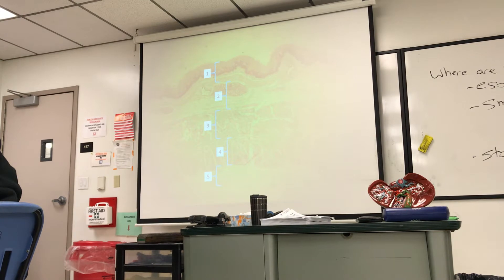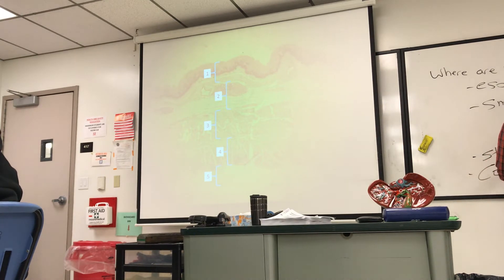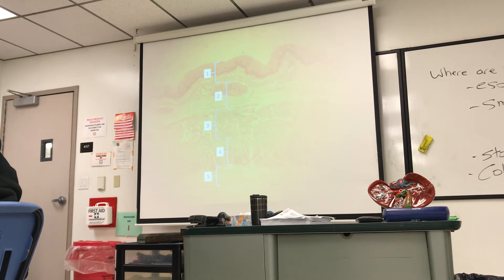And the colon. The colon has different things. The one thing I want to emphasize on colon for the histology are the goblet cells in the epithelium — the goblet cells.